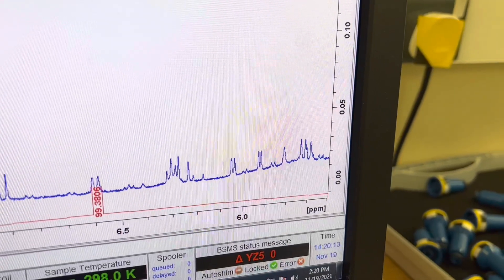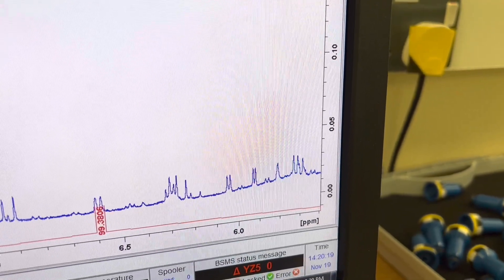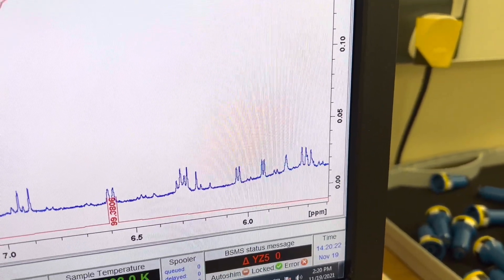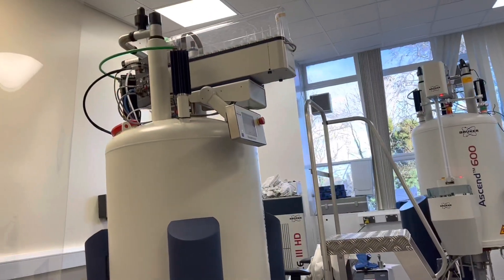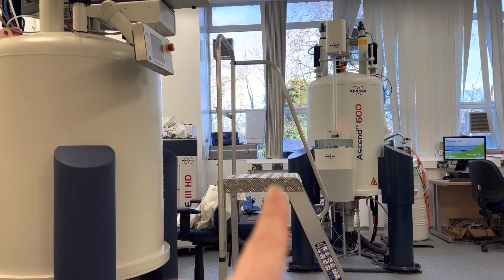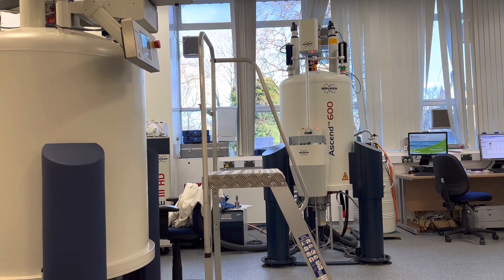So now I'm trying NMR so I can compare the NMR spectra to see if the same compounds are in the different fractions. Hopefully this will work out and then I'll know how to join my fractions together for testing them next week on the bioassay. Here is a sneak peek of some of my peaks from one of my samples, but I'm not showing you more because I don't want anybody to steal my potential new compounds! These are 400 megahertz. I love the 600 megahertz because it's so good if you only have a small amount of sample, but it's broken at the moment.